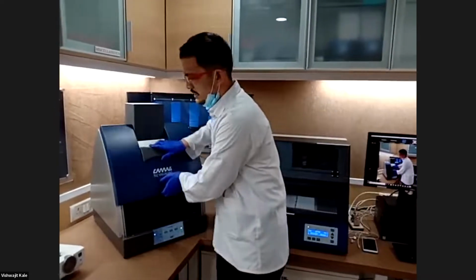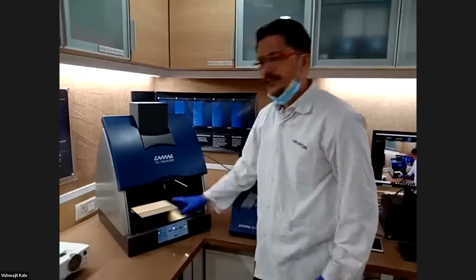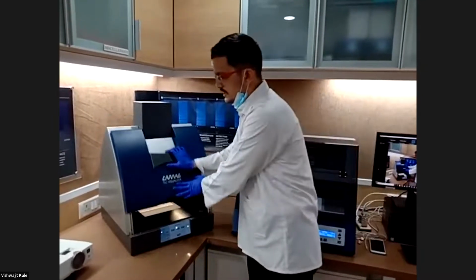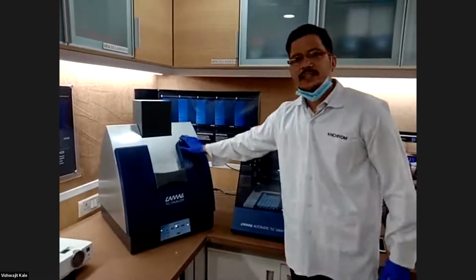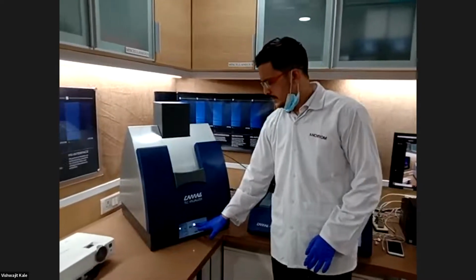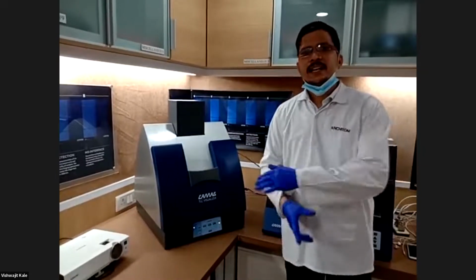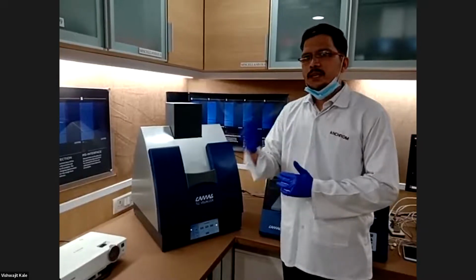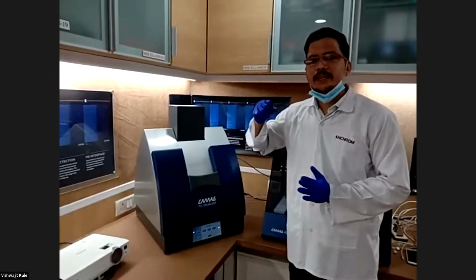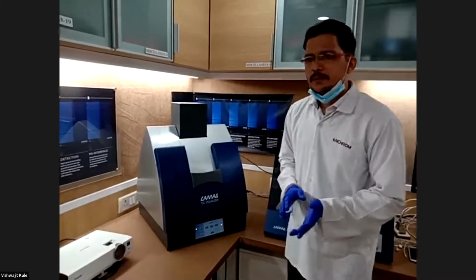So on the stage of this Camag Visualizer 2, we can keep 20 by 20 or less than that any dimension of the plate, and we can close this shutter, and this is again connected to software. After giving command from software, it will illuminate any desired lamp automatically, and after illuminating that lamp, it will automatically capture the plate image and it will come in our software for further interpretations. So in our final analysis report, our plate image will come automatically in 3 different illuminations. So as per the requirement, we can select the lamp.